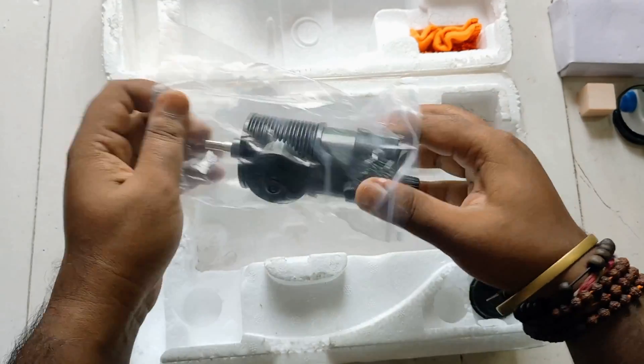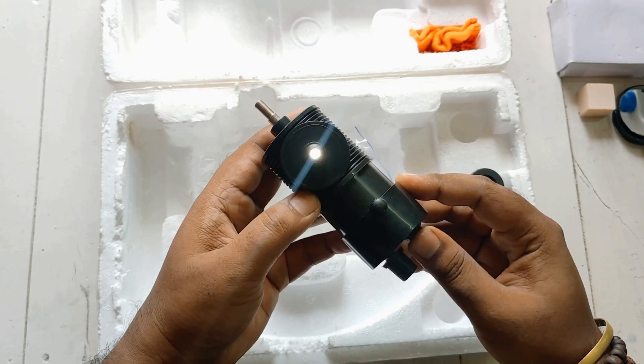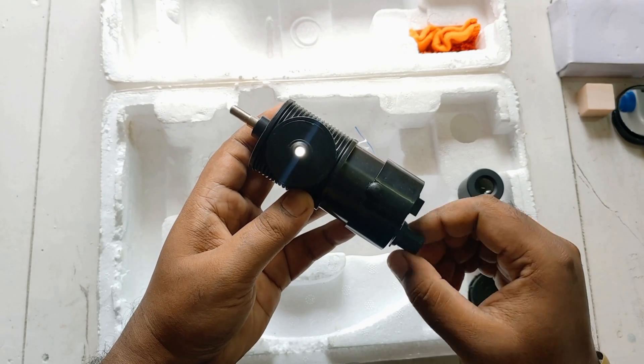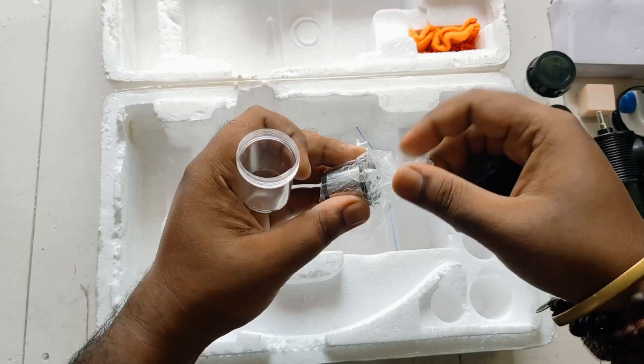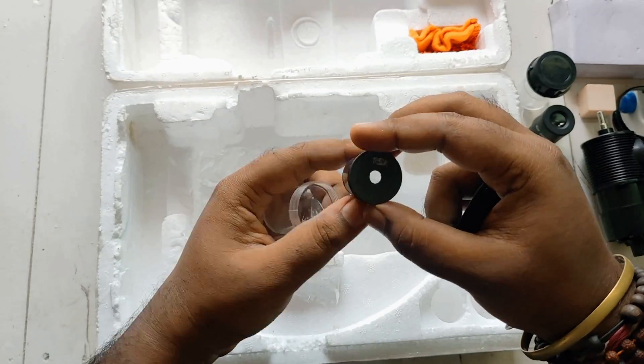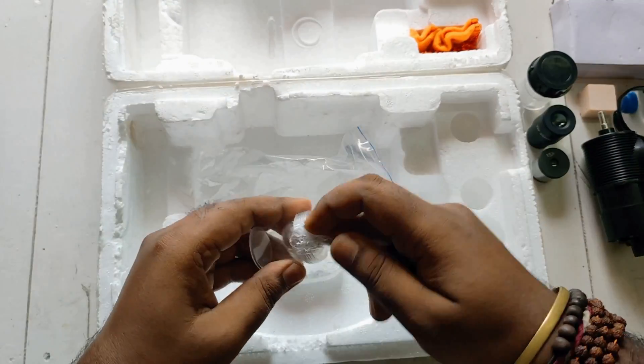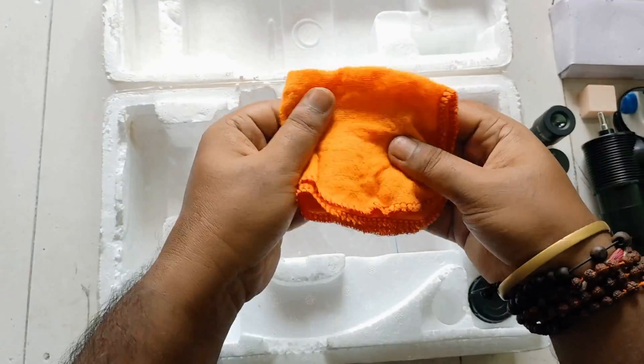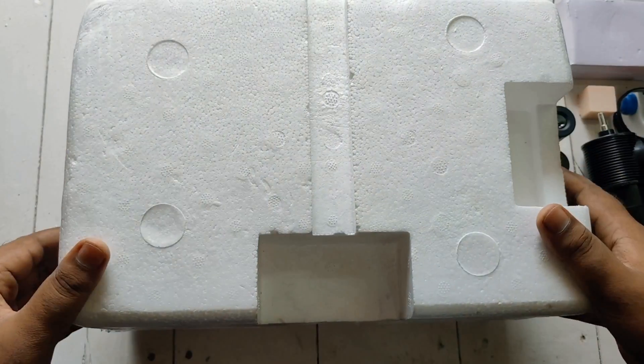This is the light, very useful in low light conditions. It also has a regulator to adjust the brightness. This is a 25mm wide field lens with 10x zoom, and this lens with 15x zoom. So these are the things along with this soft cotton cloth. This whole kit has been provided by Anand Traders. I must say the quality is great.